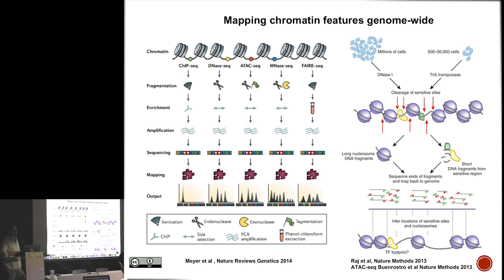So there are a few things that we can get from ATAC-seq in general. Okay? When the transposase goes and inserts itself, you can get two kinds of readouts. You're going to get long nucleosome fragments, fragments that span multiple nucleosome structures. And then you're going to get short fragments. This image shows the short fragments, where you would have transcription factors bound to those specific sites. Okay?